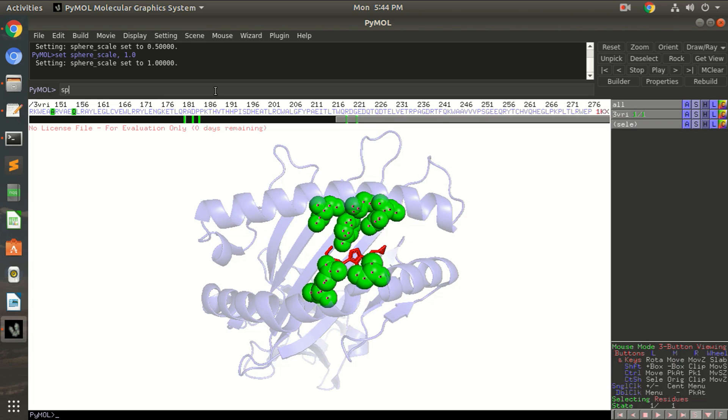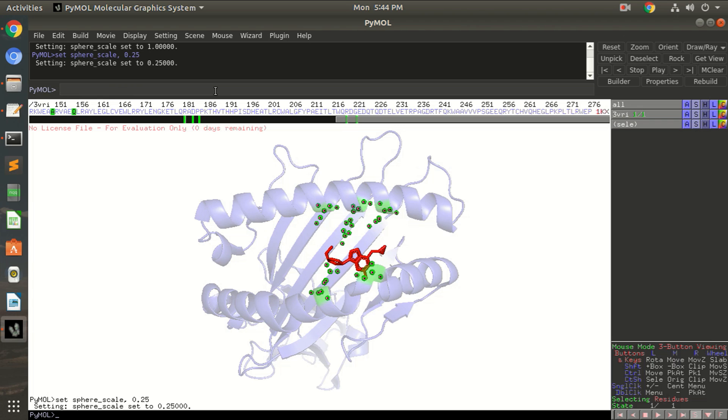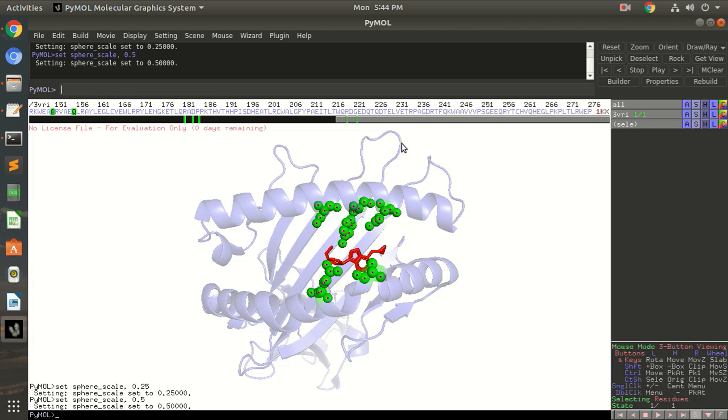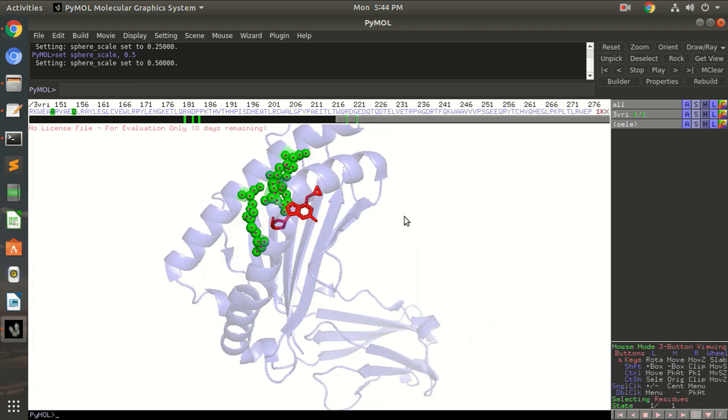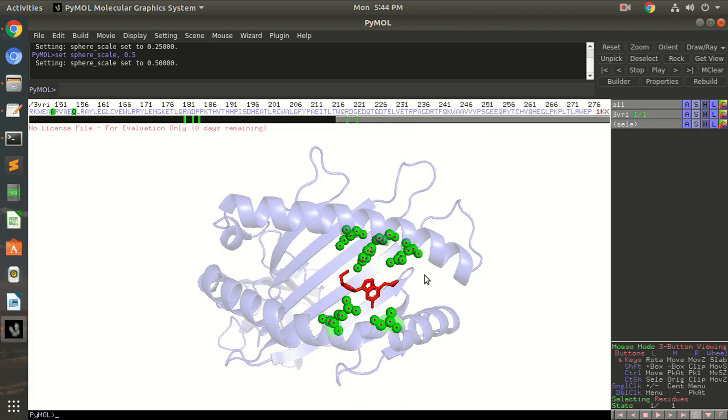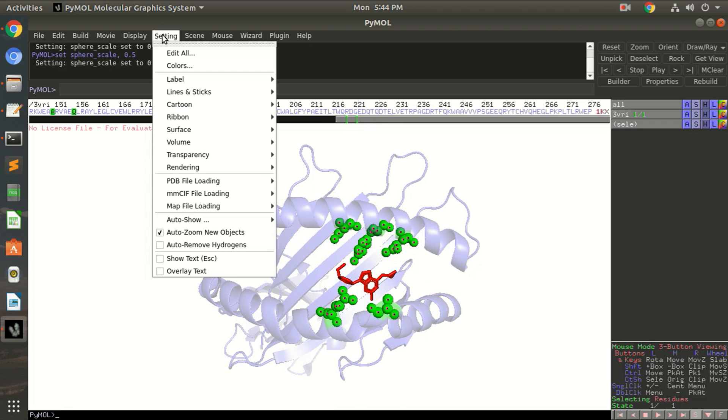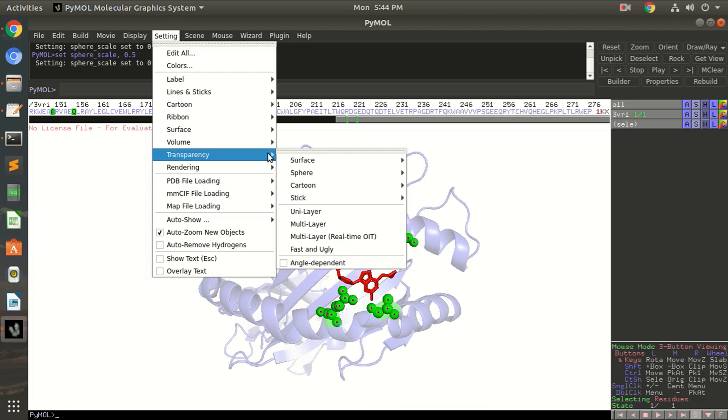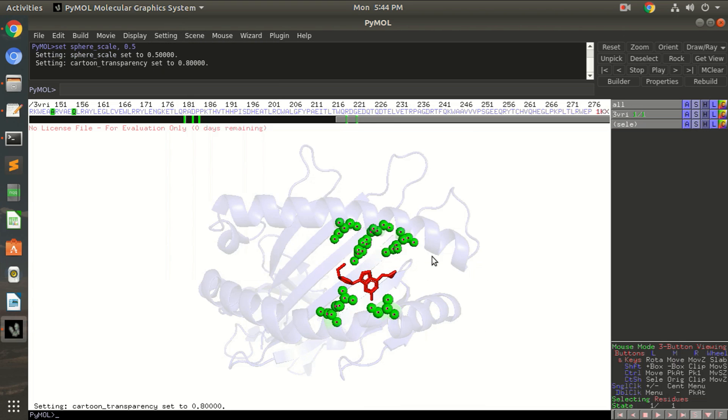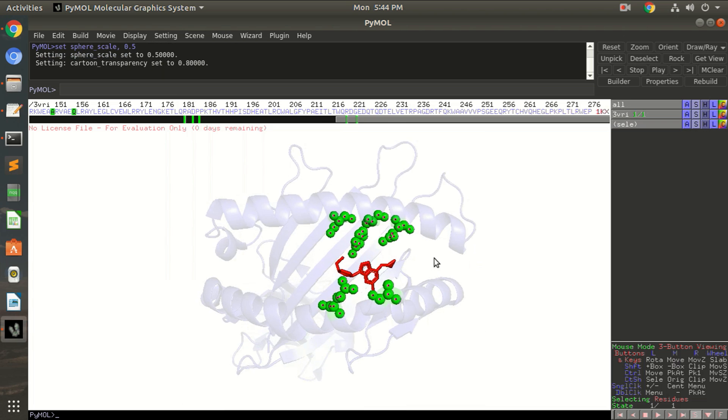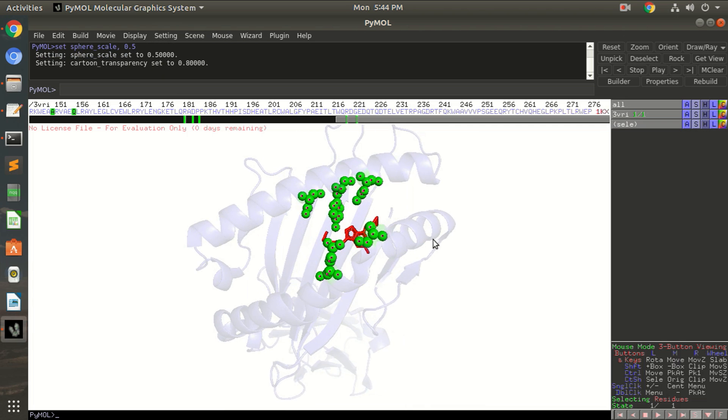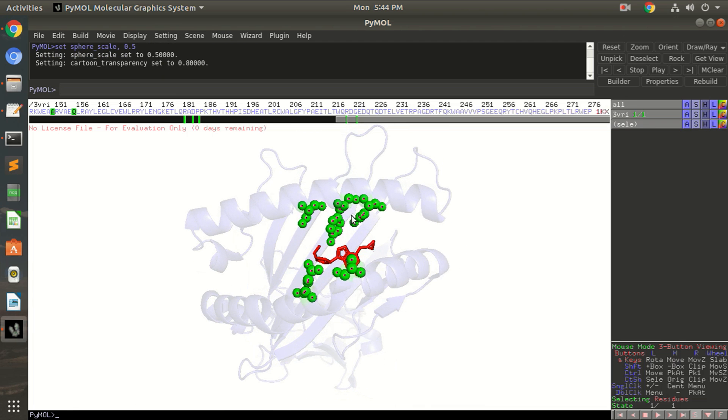Okay, now the binding residues are more clear. So if you want to reduce the size of these spheres, you can always set the sphere scale to 0.5. Okay, now they have become very small. You can set it to 0.5, so you can see the sphere size has been reduced here and the protein is really transparent.